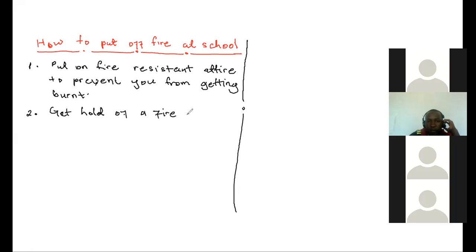So get hold of a fire extinguisher and pull the pin immediately.